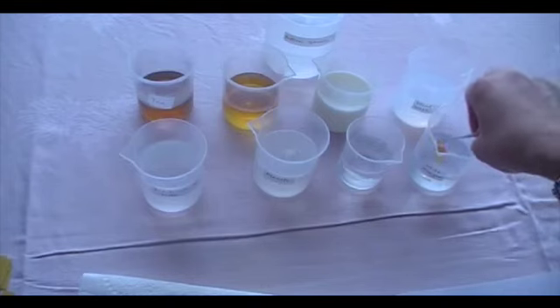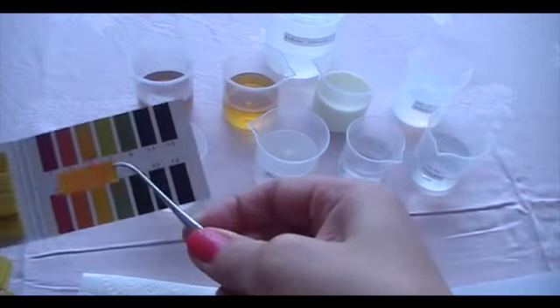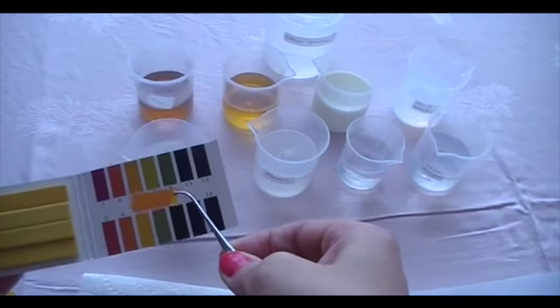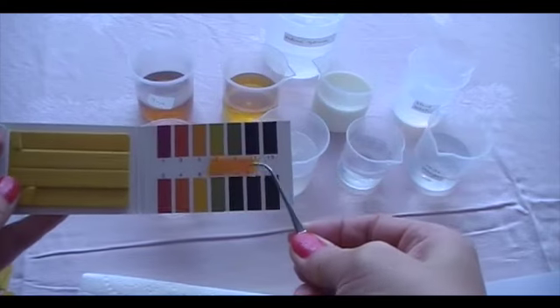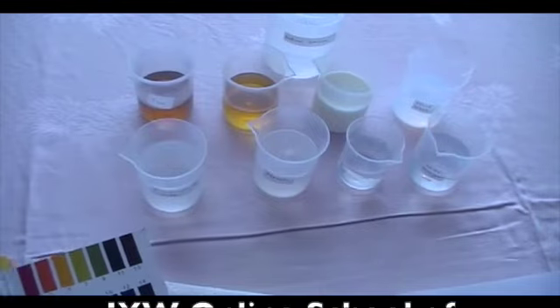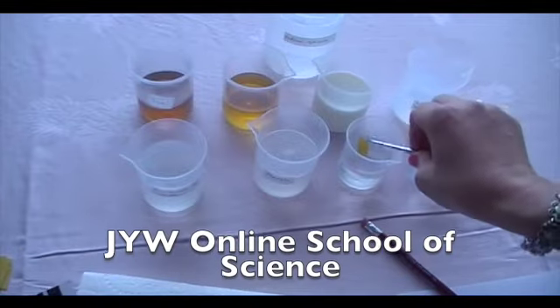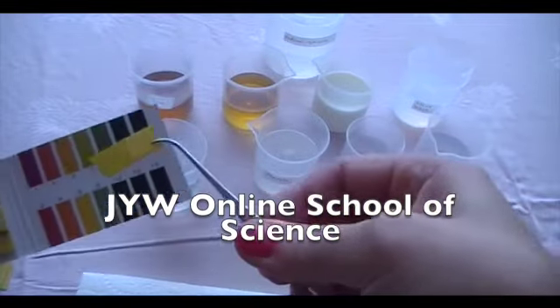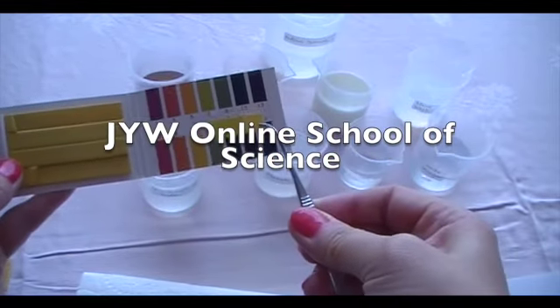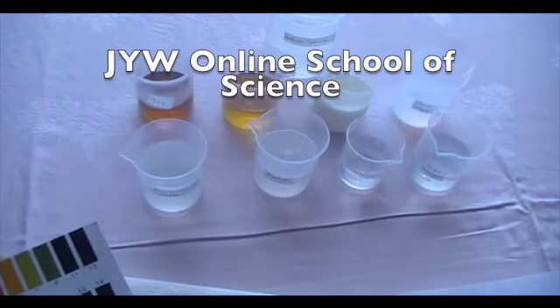First one, this is white vinegar. If you look at it, you see the color is most likely pH 5. Can you see that? pH 5. Okay, that's white vinegar. And the next one, we have water. Can you see the color? It's 7. So water is 7.